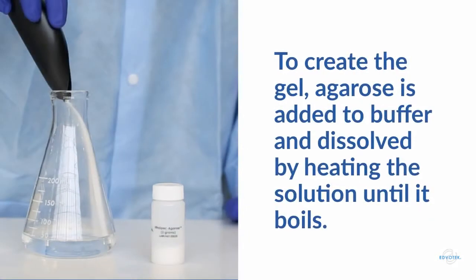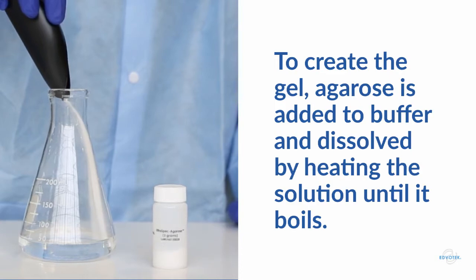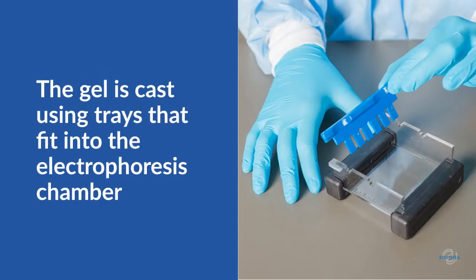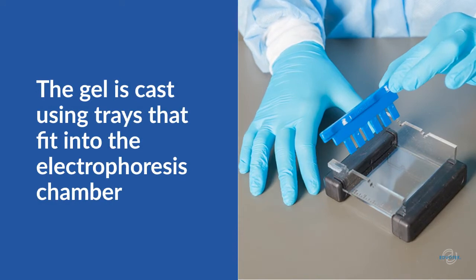The first step to running agarose gel electrophoresis is creating the gel — the equivalent of making a scientific jello mold. Agarose powder is added to electrophoresis buffer and heated to boiling so that it dissolves. As the solution cools, it solidifies, taking the shape of its container. Therefore, we cast the agarose gel using a mold so that the gel fits into our chamber.